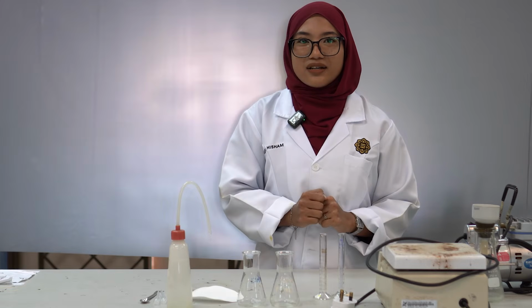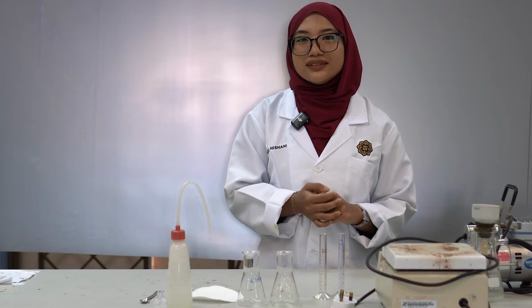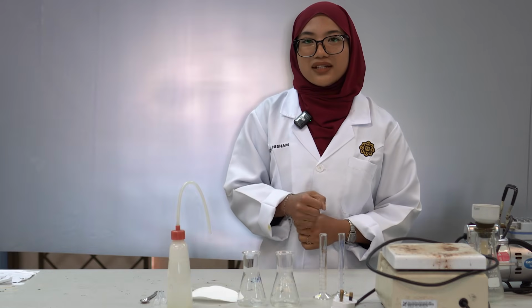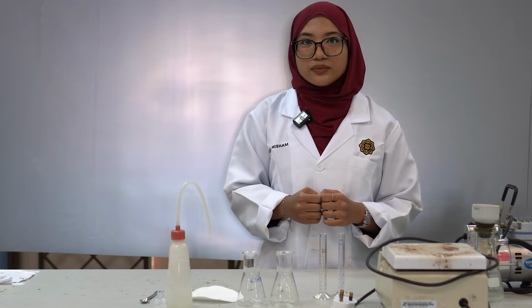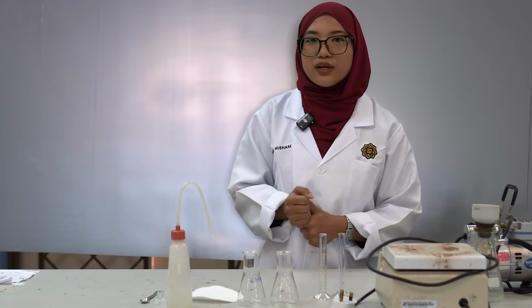Alright, so I'm going to talk about the applications of the recrystallization process. As chemical engineers, of course we do a lot of recrystallization, because it is a crucial process in industry. So first, for example, in the pharmaceutical industry, we extract drugs, for example paracetamol, ibuprofen and ranitidine.